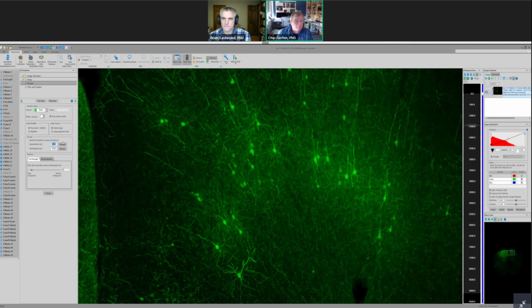Okay, so the first thing we do is measure. Actually, Brian, why don't you go through and describe? Sure. You go ahead and measure, and I'll talk about what you're doing. One of the first things is we have to set up parameters for the largest potential cell that we're going to be detecting. It comes up about 19, and we're going to set that to 25 just because we'd like to go above that. Then we're going to measure the small cells, and these don't have to be completely accurate. We just want to get a range.